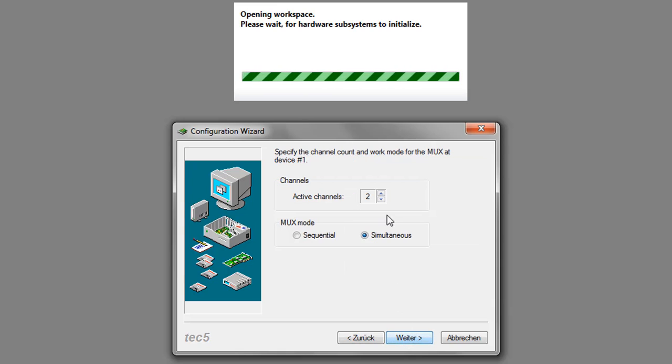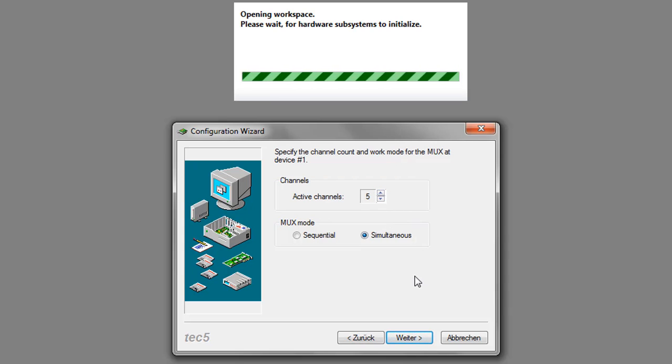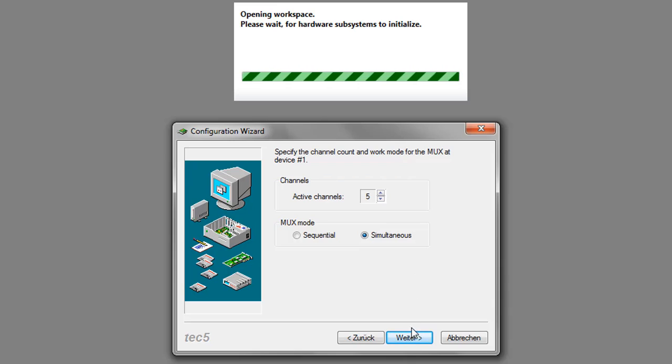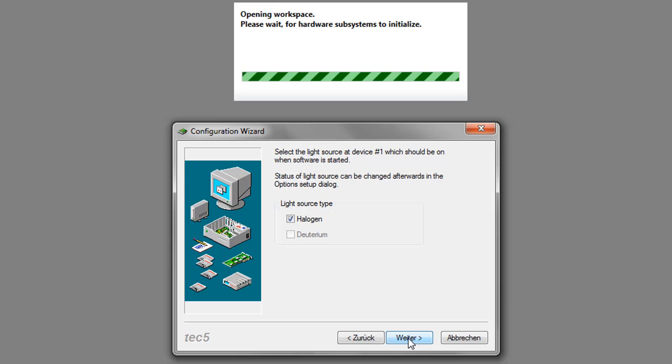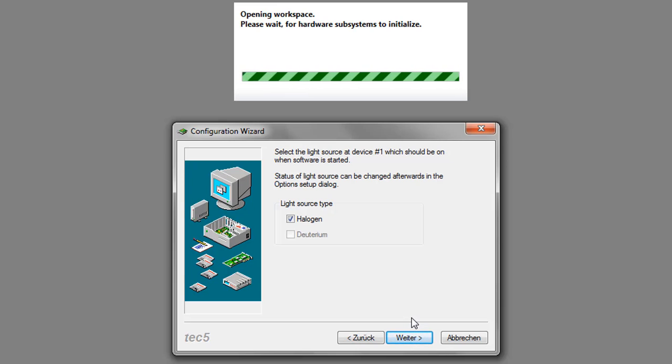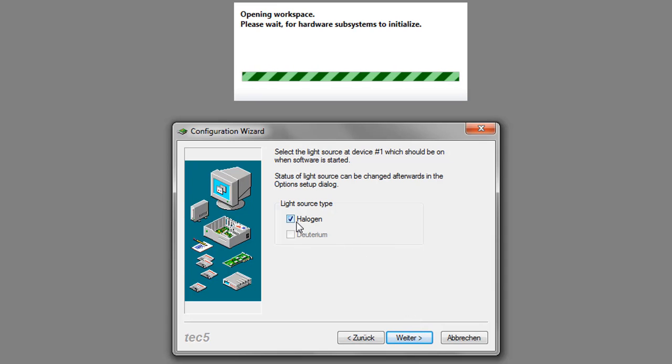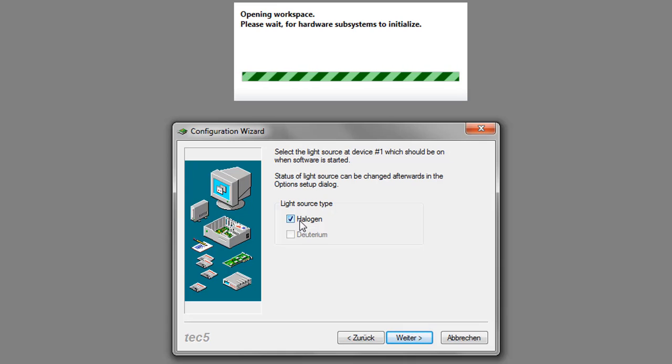Now you have to select on the number of active channels. In my case, I decide for 5 channels. If a light source is included in the spectrometer system, you will have to give some additional information. The checkbox next to halogen indicates that the halogen lamp is operating.